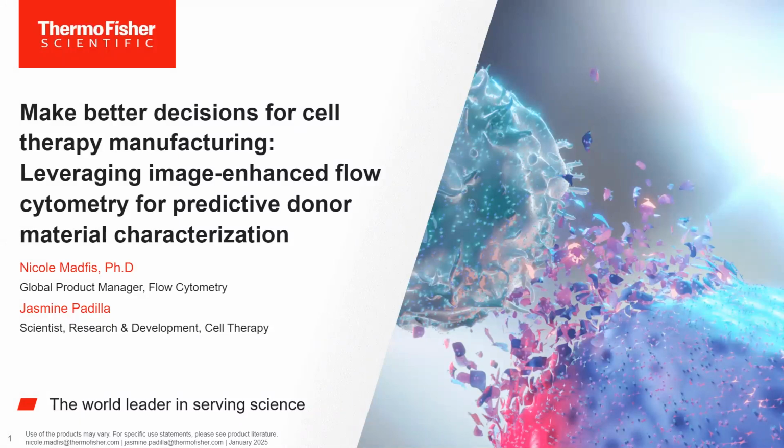Thank you for the introduction. Today, we want to present to you one of the exciting projects we're developing for cell and gene therapy workflow using imaging-enabled flow cytometry. Today's presentation will be given by myself and my colleague, Jasmine. She will present work performed by her and the bioinformatics team regarding the creation of a predictive AI model that can be used to evaluate donor material for cellular therapeutics.